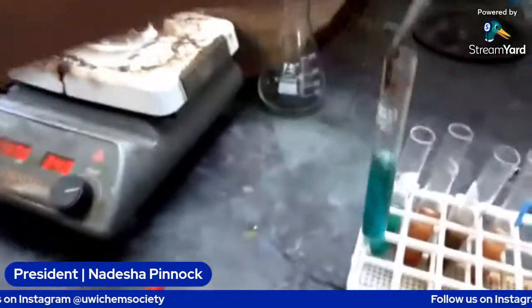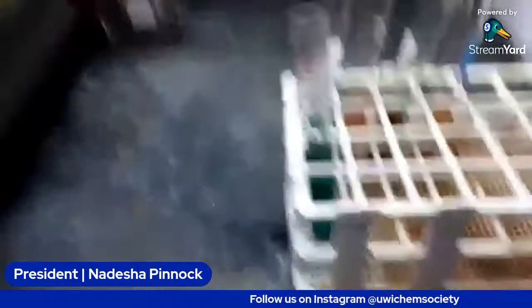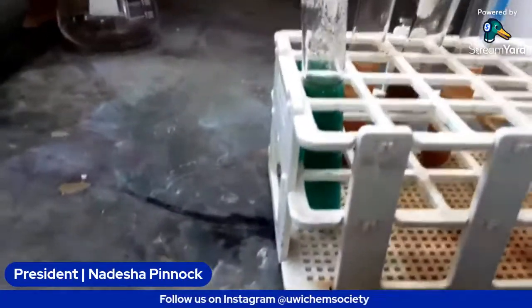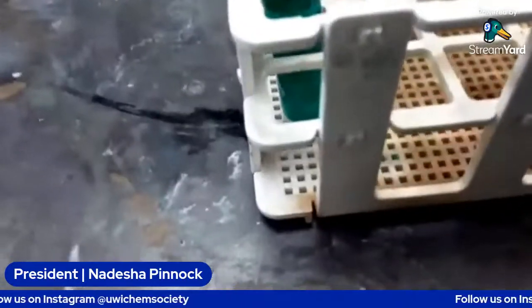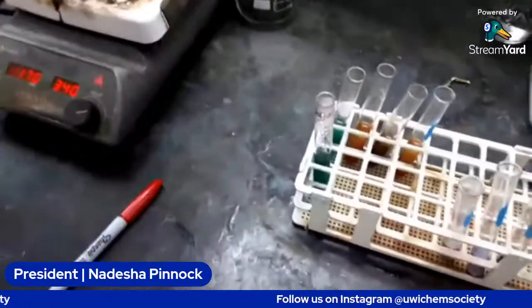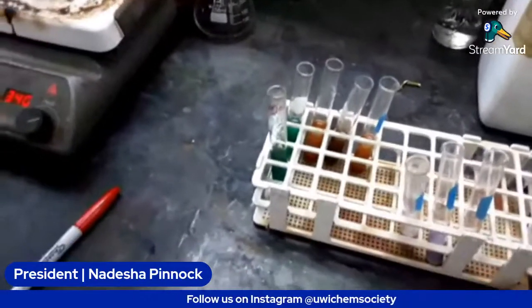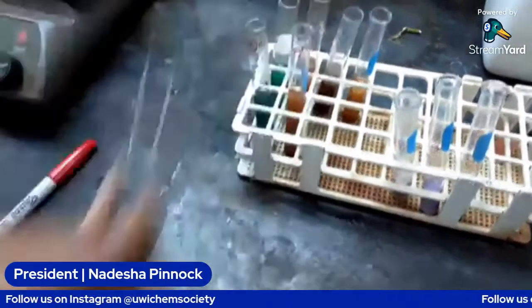And it's the blue-green solution. So we did say blue-green means a low concentration of sugar, but we also know that sucrose is a disaccharide, and it is not one of the disaccharides that is a reducing sugar.